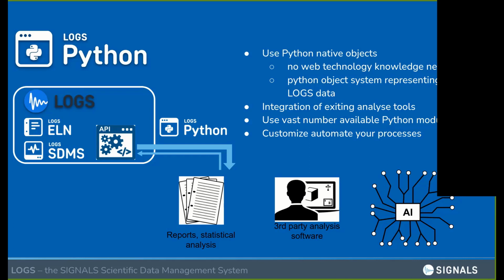So this logs Python library will also allow you to integrate your logs system to other tools, because many tools are either even written in Python or have a Python interface, which is quite common these days as Python becomes more and more a standard language for data mining, data analysis, but also for scientists in general. And you have also in Python a vast number of available libraries that allow you to do this kind of analysis, which I will also show you in an example.